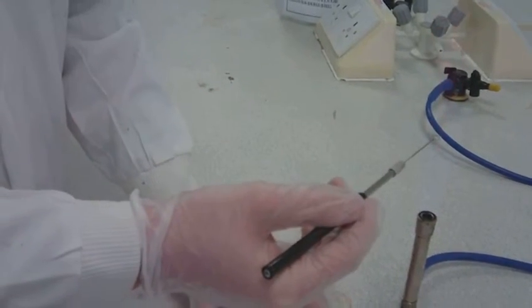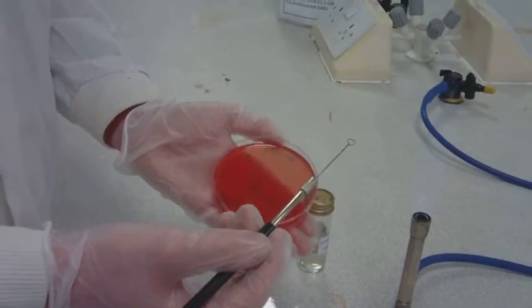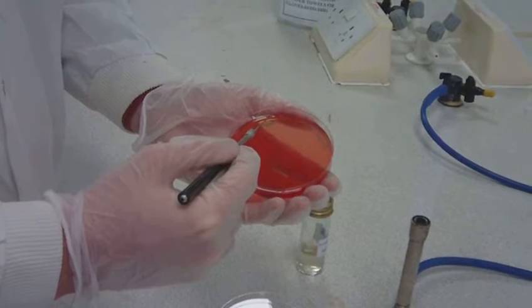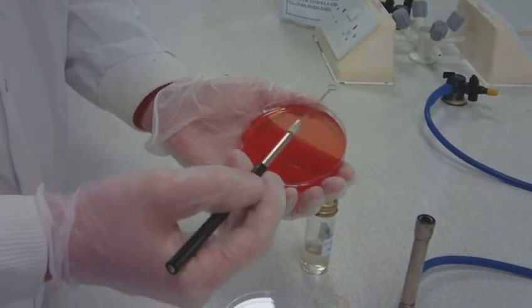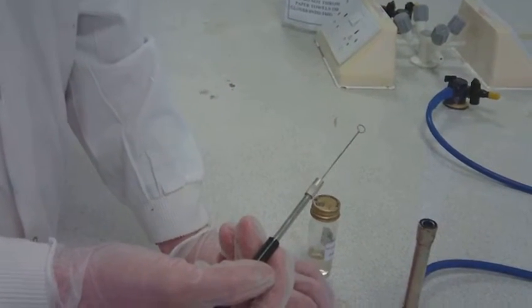Re-flame the loop and then in the last quarter of the agar you need to streak the bacterium in a zigzag formation from the outside of the agar towards the centre. Be careful not to streak the bacterium where you previously streaked as it will not give the desired separation. The zigzag of the bacterium should not touch the sides of the petri dish.